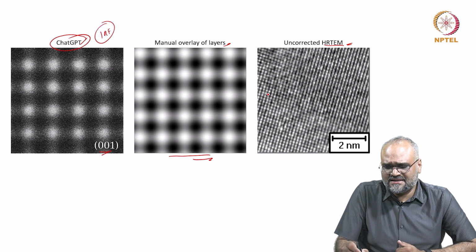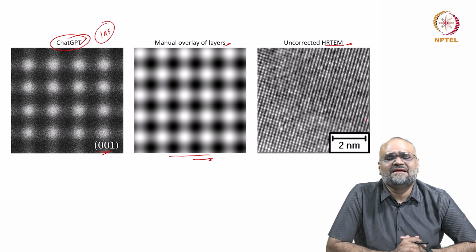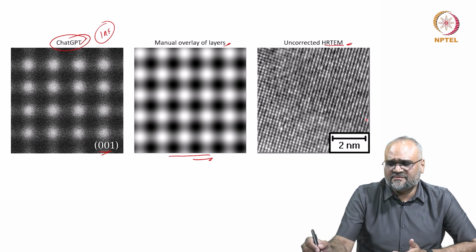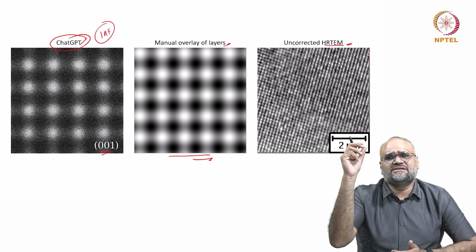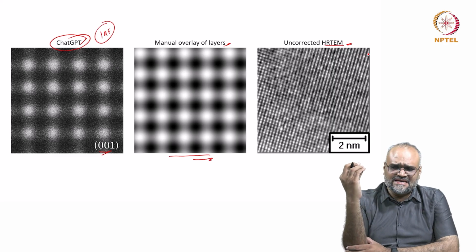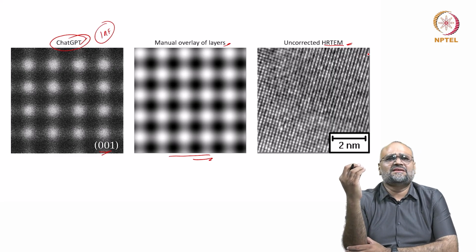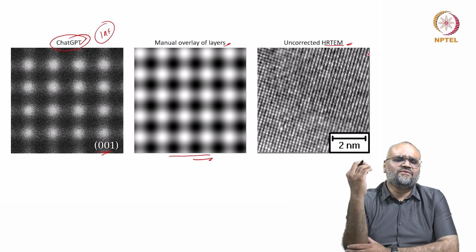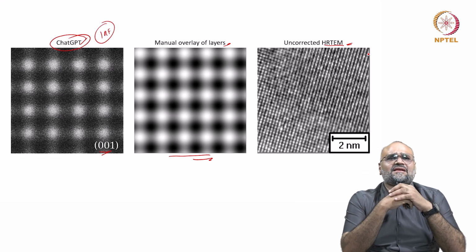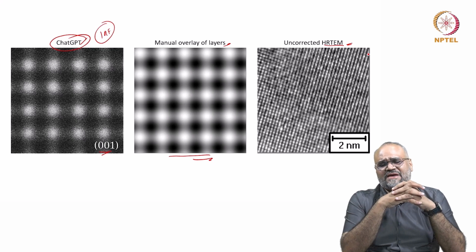What I see here is a variation in the intensity as a consequence of phase shift caused by the columns of these atoms, which are also acting as scattering centers. And as a consequence of these atoms being associated with an electrostatic potential, we introduced a concept called the potential well and the phase object.